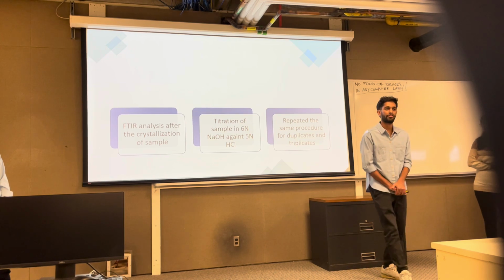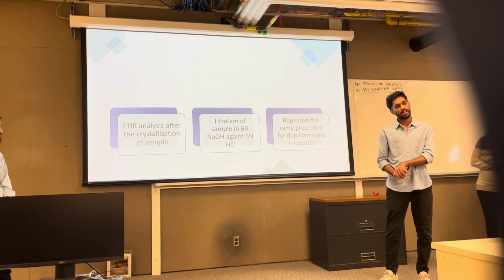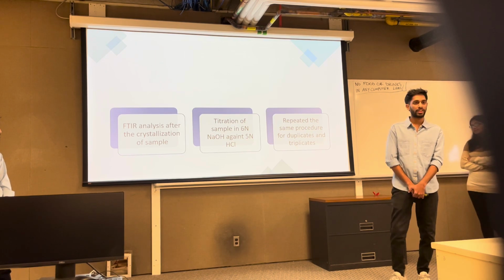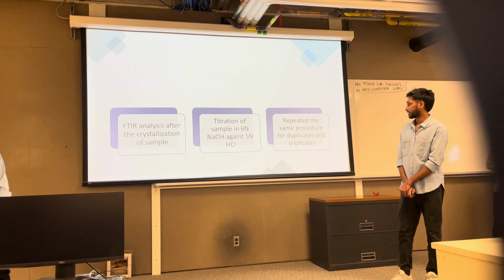We did FTIR analysis with our crystallized sample, and after that we did titration just to confirm the presence of fulvic acid. Then we did duplicates and triplicates just to confirm our results.